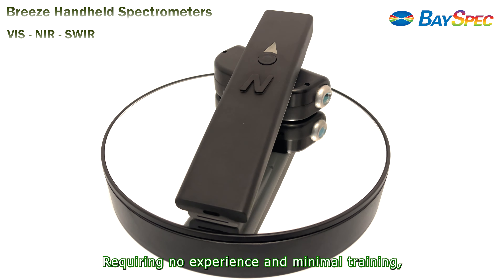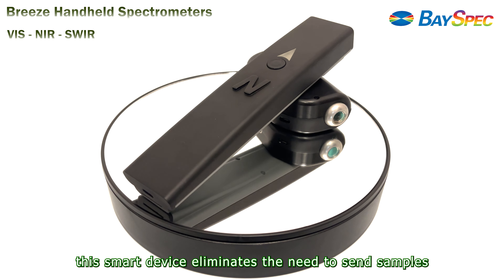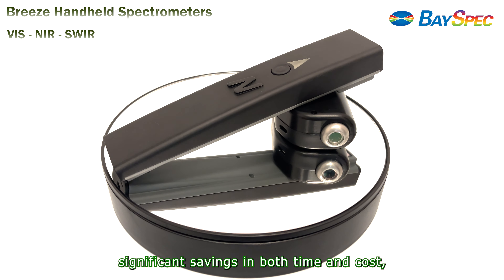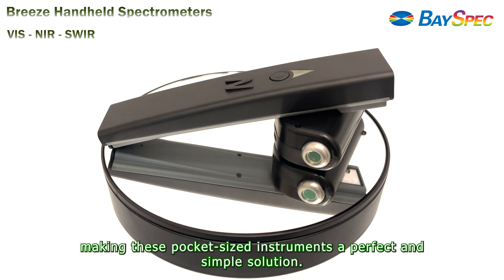Requiring no experience and minimal training, this smart device eliminates the need to send samples for costly laboratory services, which amounts to significant savings in both time and cost, making these pocket-sized instruments a perfect and simple solution.